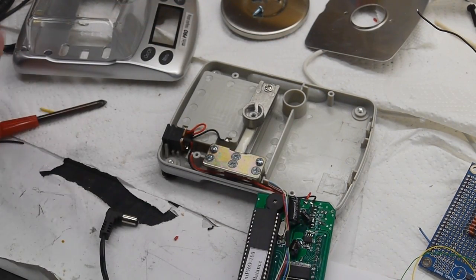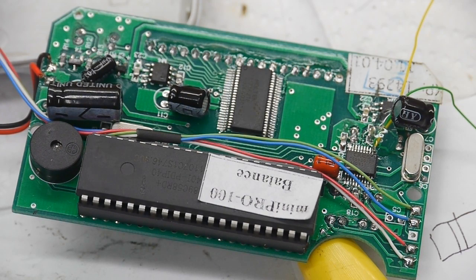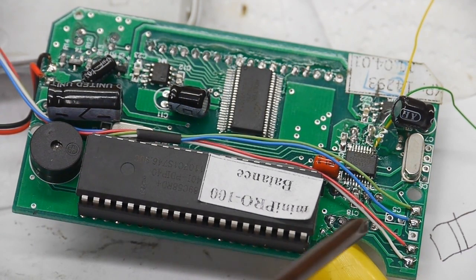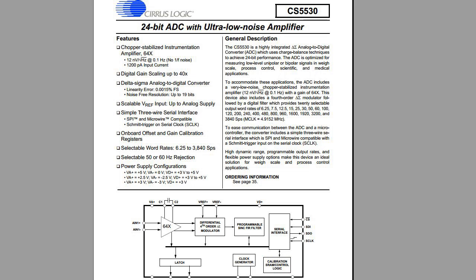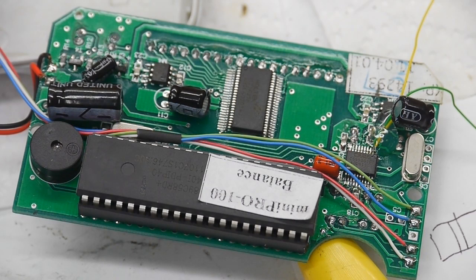I'll give you a circuit overview. These wires here are where the strain gauge connects to the input of this thing. It's a weighing device, so its main sensing technology is a classic strain gauge. There really isn't any analog path to speak of - the sense wires from the Wheatstone bridge go through a ferrite bead inductor and then right into this chip, which is a CS5530 24-bit analog-to-digital converter. That chip probably accounts for most of the cost of the whole item, besides the strain gauge.